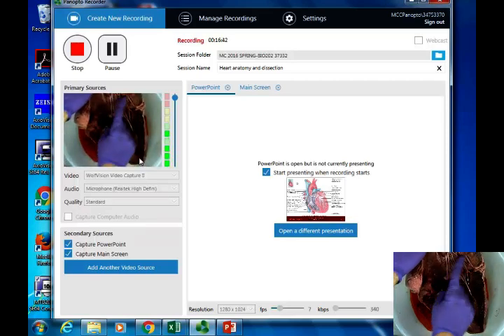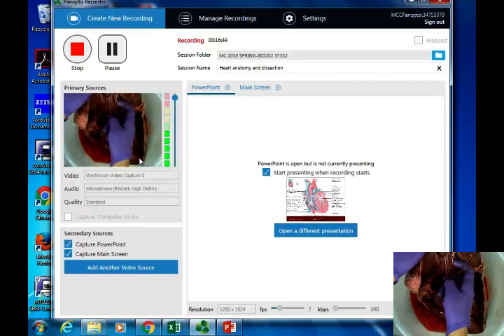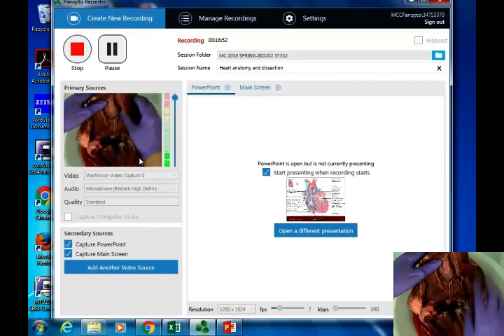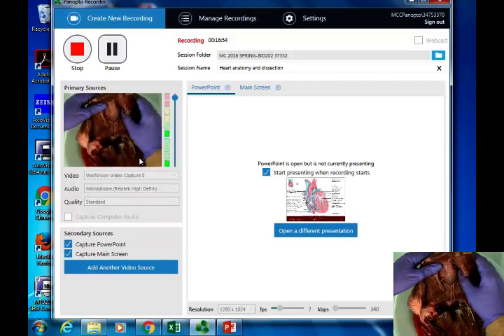And look at these chordae tendineae right there. Talk about heartstrings. Those are some really hard heartstrings right there. You can see them attaching to the papillary muscles along the wall there. You can see some of the trabeculae carneae as well, the other ridges.